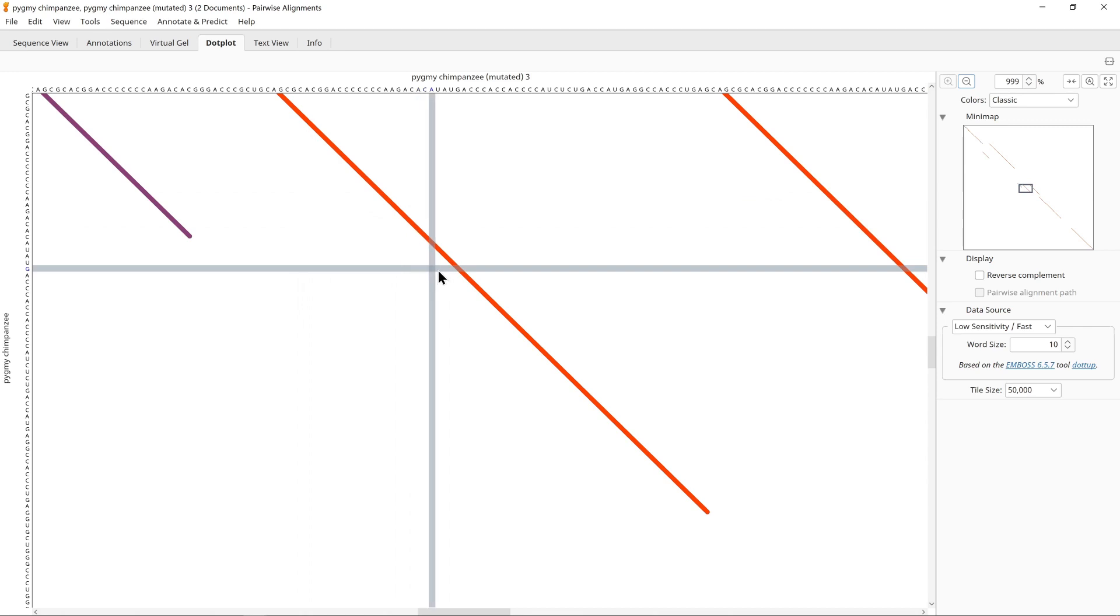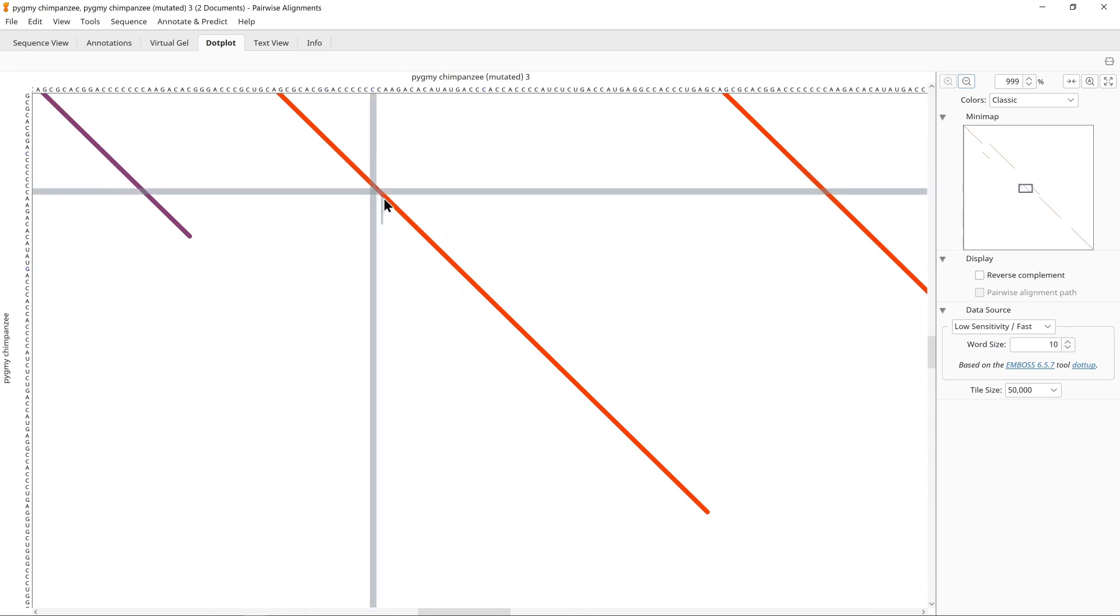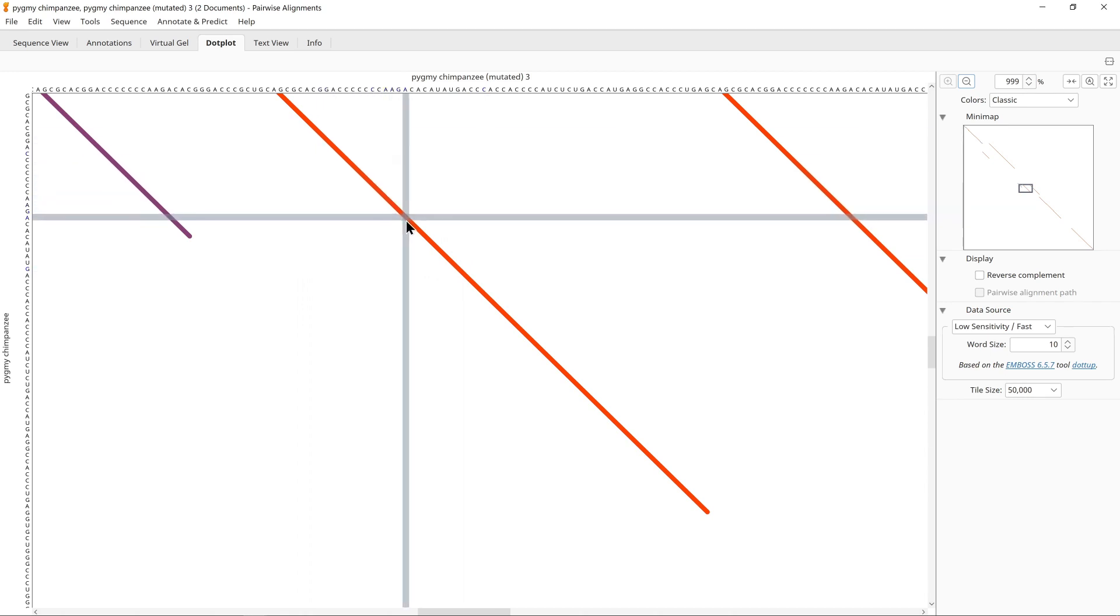Also, notice how there is a cross here that follows your mouse. This gives you the position in the two sequences of your pointer. You can use this to note the location in the dot plot of features you are interested in, and this will help you later when you start producing alignments.